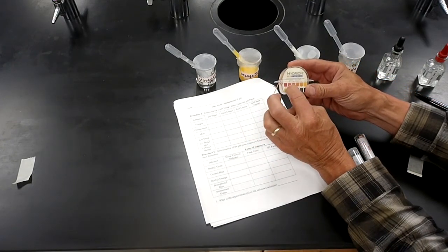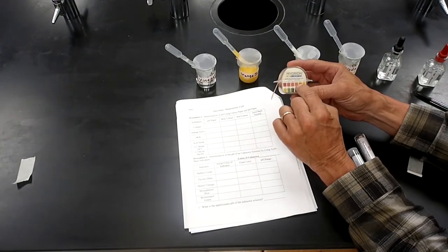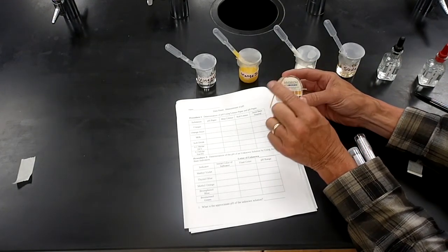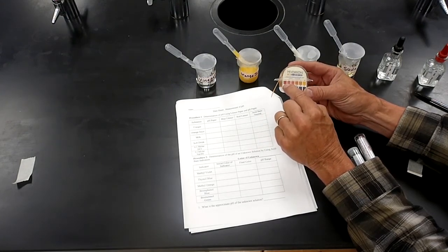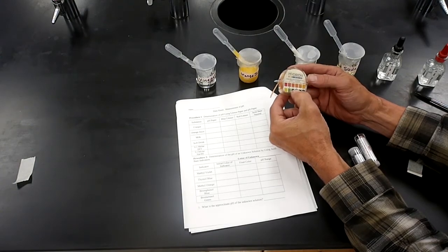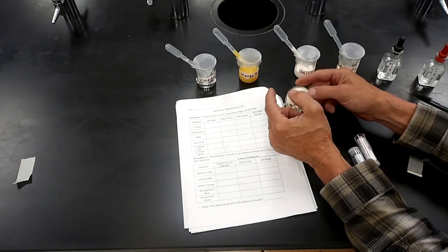It's got chemicals in it that will change color depending on the pH. So what we'll do is we'll put 1 drop of these substances on this paper. It'll change color. We'll compare the color to this color scale, and it'll give us an approximate pH, much like a pool test kit.